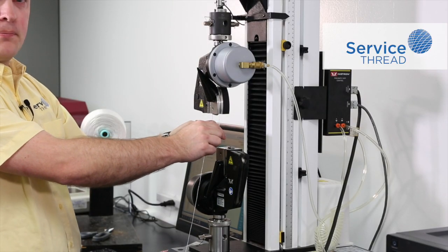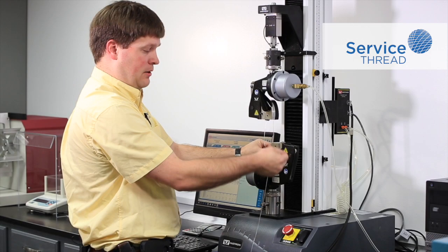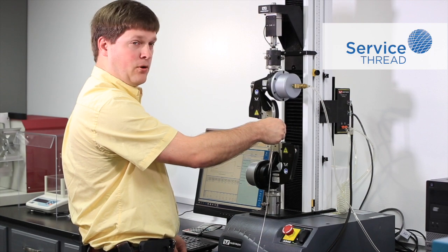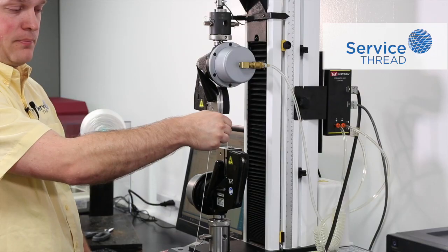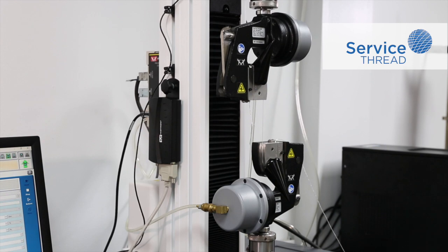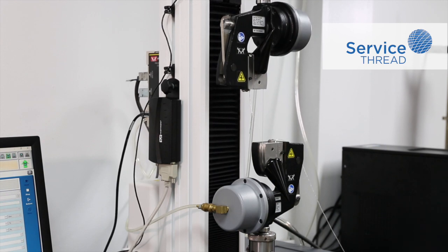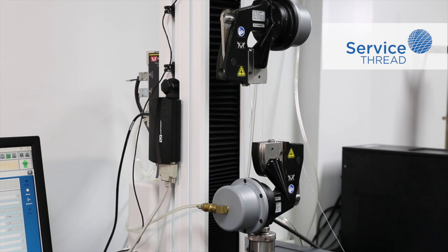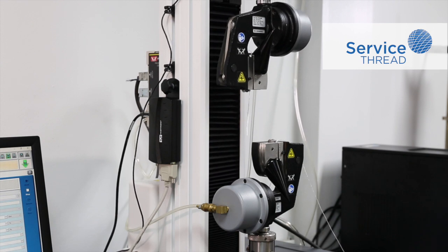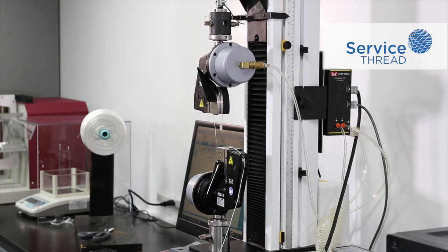To start the test, we'll insert the yarn into the upper grip, and then we'll follow up by wrapping the yarn around the lower grip and closing it. The machine will start automatically, and the values are recorded on the computer.